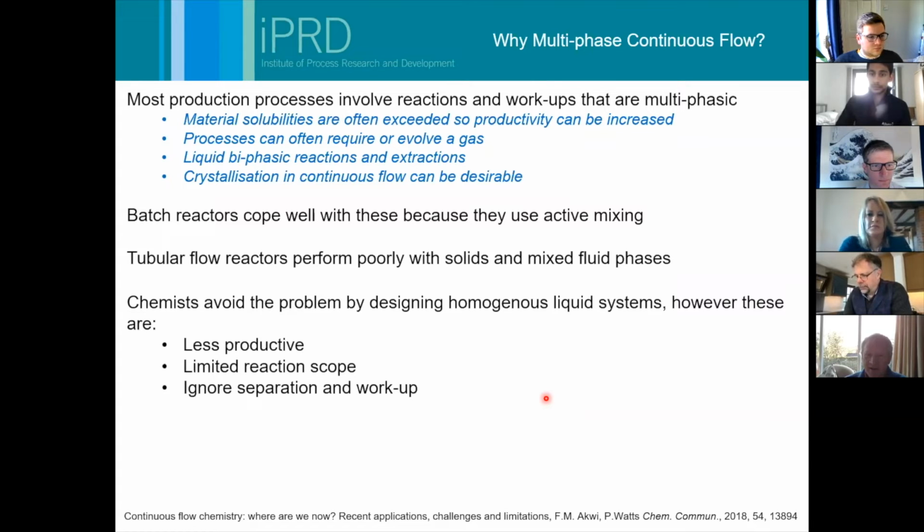And as we're all taught as undergraduates, batch reactors work very well with that, because the round bottom flask with a magnetic stirrer copes very well with lots of different phases. And we never even think about the mixing really in there as chemists.